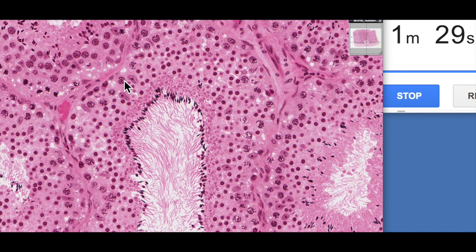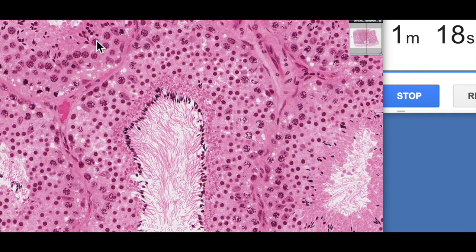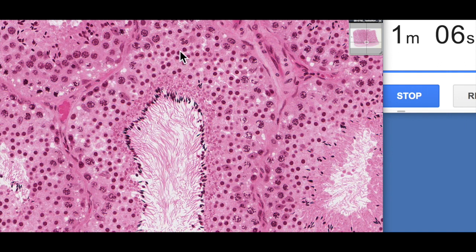They then enter into meiosis I and become known as primary spermatocytes. The primary spermatocytes are these large nuclei with a strange-looking chromatin appearance, almost like a leopard-skin pattern — you can see a number of them here as well. They undergo meiosis I, producing two secondary spermatocytes, which immediately enter into meiosis II, producing four spermatids from those two secondary spermatocytes.